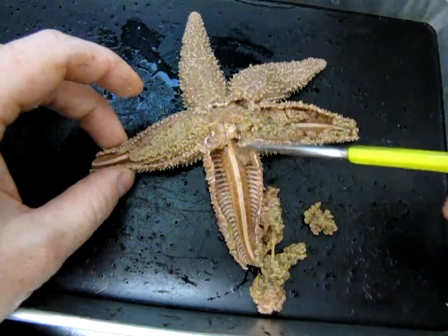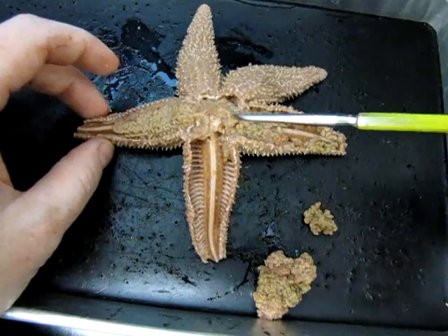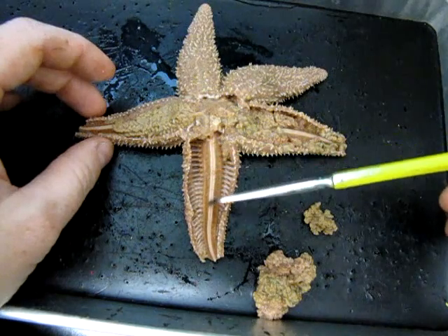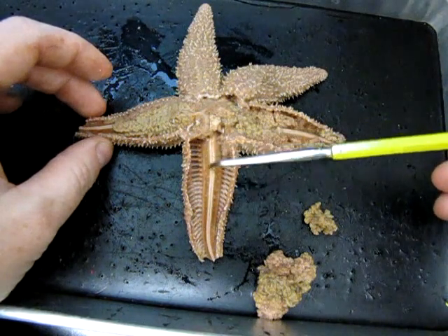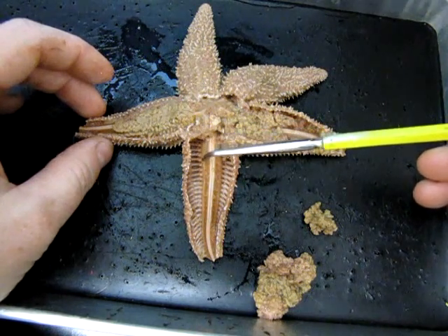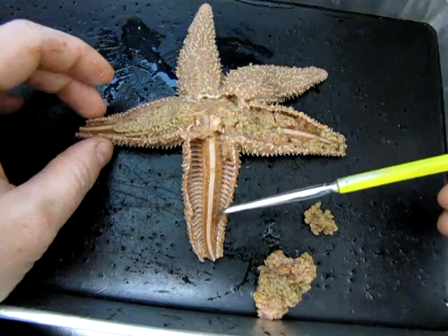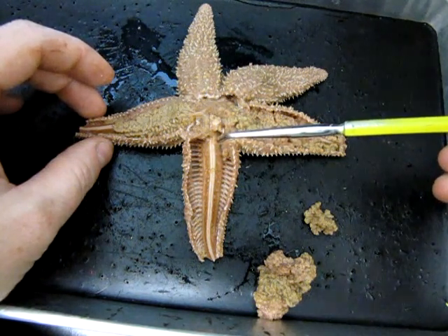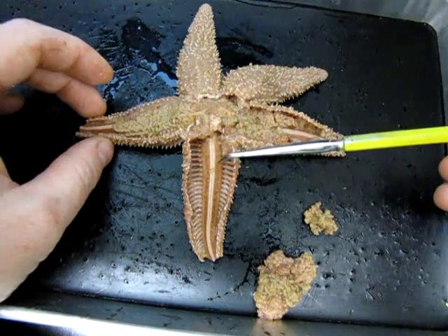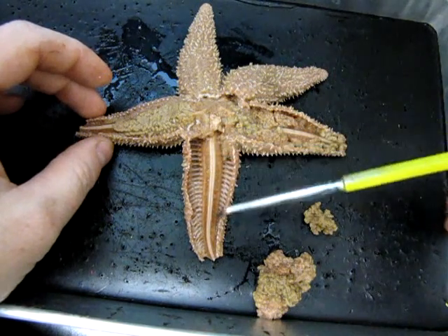Now we're getting into something completely different. You'll note right away this sort of bony-looking ridge here — this is called the ambulacral ridge. On either side of the ambulacral ridge, along these surfaces, you may be able to see some very small, round, jelly-like little structures.